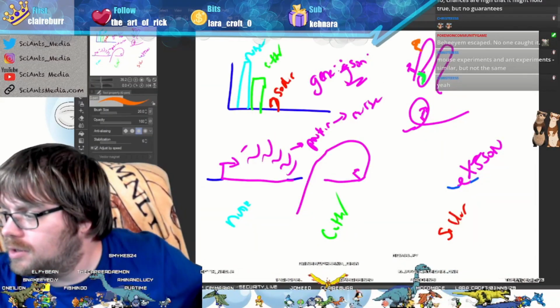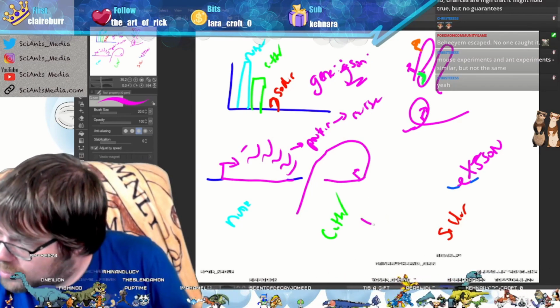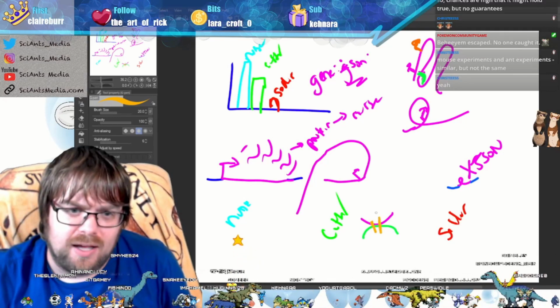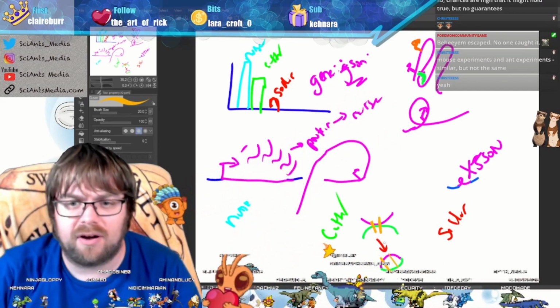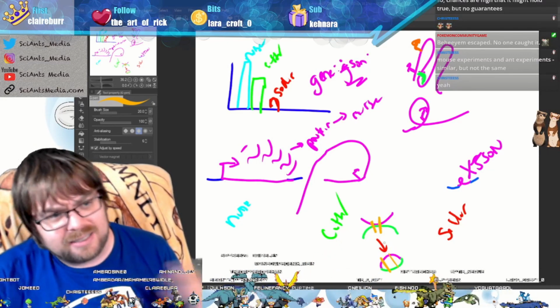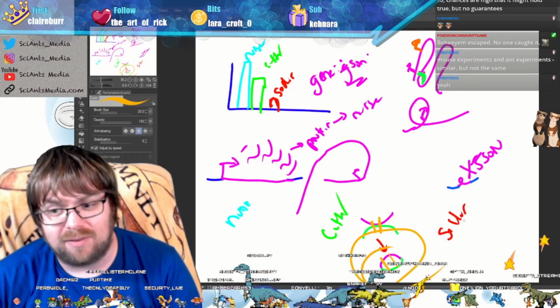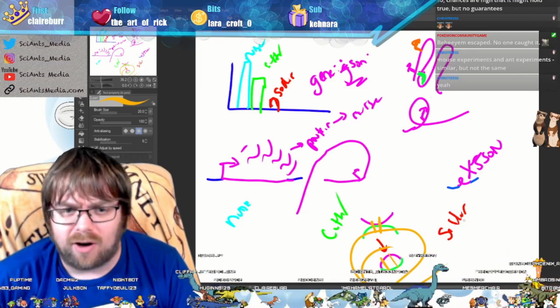So to do the experiment, let's say that purple region is close to the green region, they stick together. So you glue that, you keep them glued together with formaldehyde, and then you fuse these ends together, so they make this nice little circle. They're still glued together, and then after you've done that, you remove all the waste material and things that didn't stick together from your solution, and then this is what you end up sequencing. And that lets you figure out the proximity of the genes and how they look in 3D space. Are they accessible? Are they open? Are they near other genes?